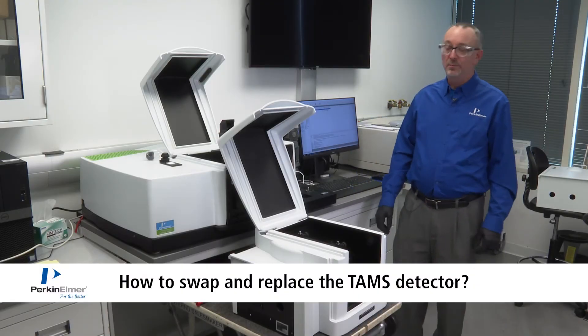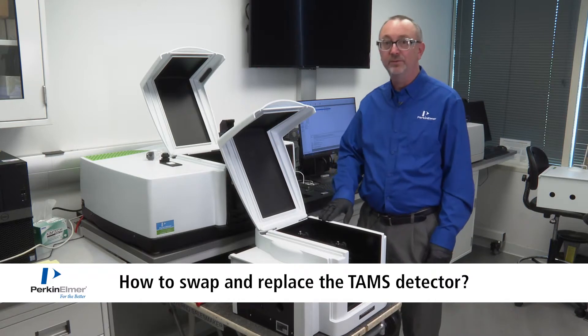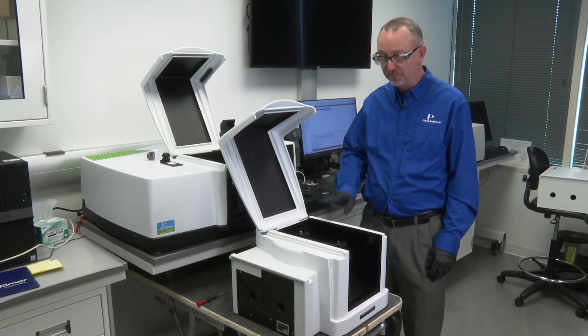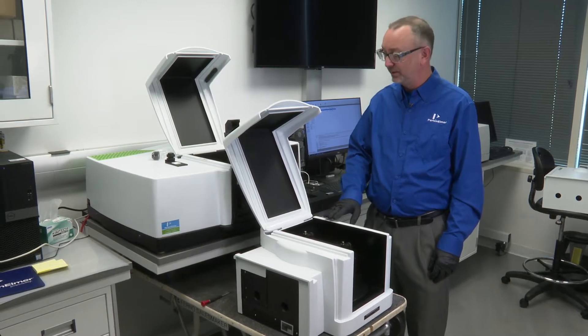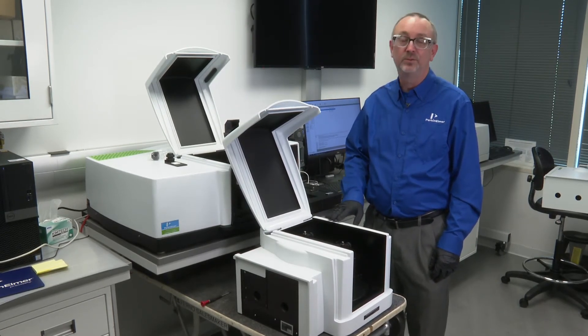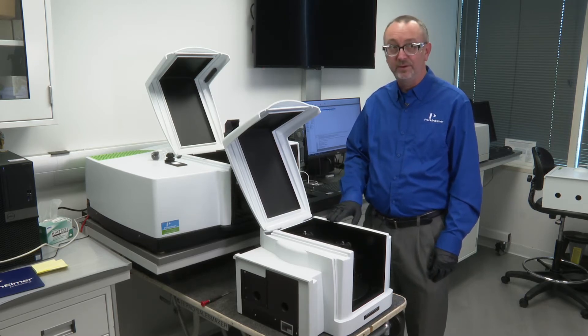The modularity of the high-performance lambdas is exemplified by the use of the TAMS accessory, the Total Absolute Measurement System. This accessory is also modular in and of itself. The detector components can be removed easily by the end user. In fact, there are seven options for detectors.